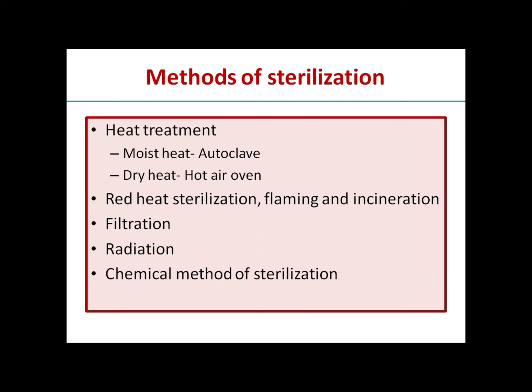We have some other methods applied for sterilizing a substance, like sound waves, and also under pressure. Those things will not be discussed here in this video. We will focus on these few methods of sterilization which are mostly done in a plant pathology lab.